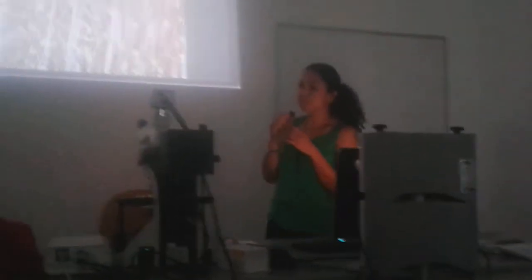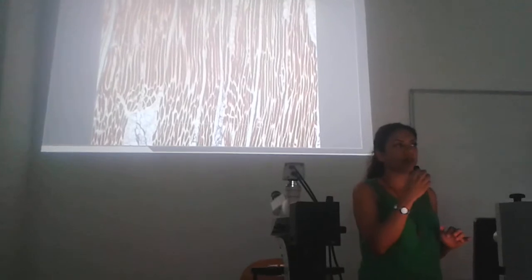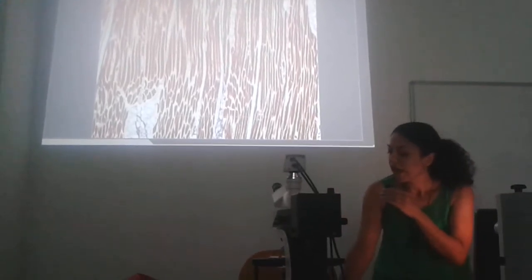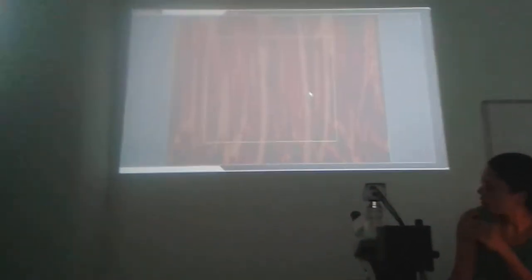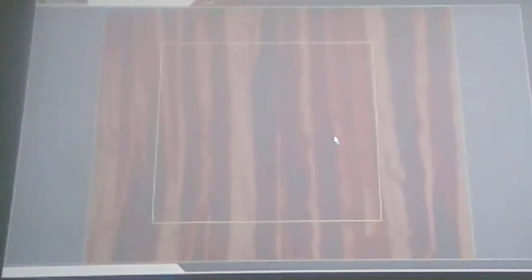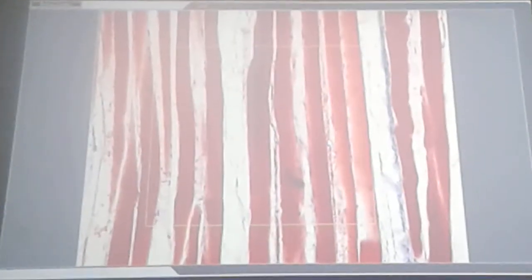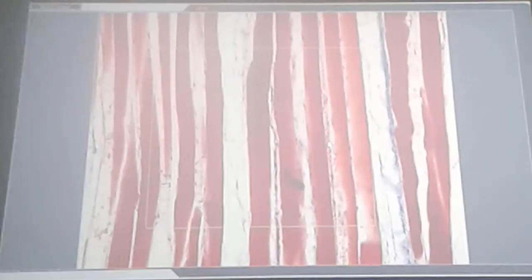And muscle fibers, which are also called muscle cells, make up this muscle tissue. We call them striated because they have striations, okay? If you magnify your slide under your microscope, you may be able to see the striations. But at the moment, the microscope image is not clear.